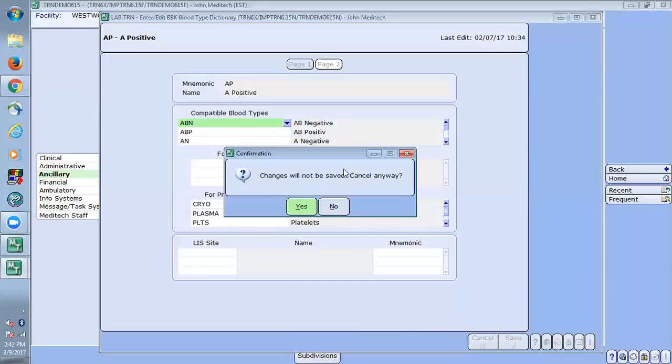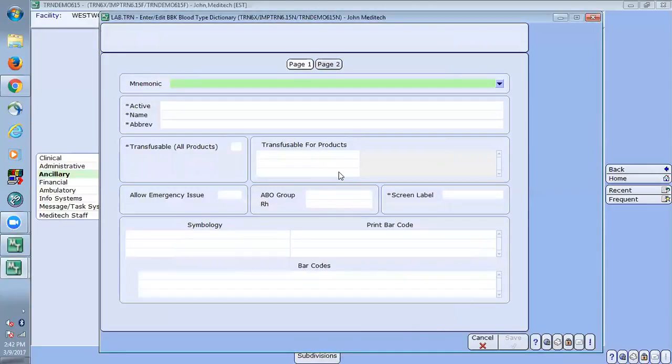All right. So we can take another maybe 1-minute break, allow some opportunity for questions to come in through the Q&A, and then we'll proceed along to the BBK department and test dictionary.